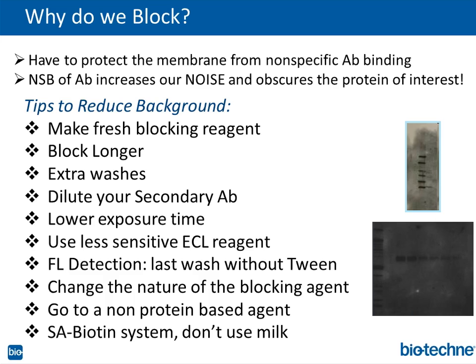So some folks, and this would be my recommendation, if you're having sensitivity issues, and I'm addressing sensitivity here a little early, you might want to lower the percentage of blocking agent so that you're not blocking all of your protein epitopes, and you're exposing them to give you greater epitope access for your antibodies. That might help with your sensitivity a little bit by not always using 5% non-fat dry milk. Again, every antibody, every situation, and every epitope is different, but the concept, I believe, is true. So that's one thing: change your blocking agent.